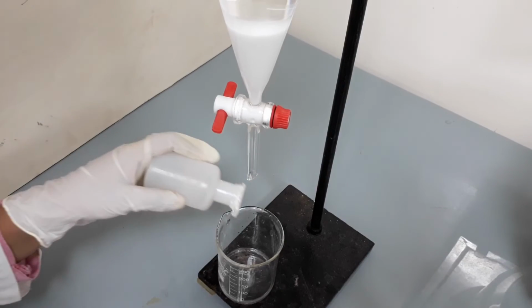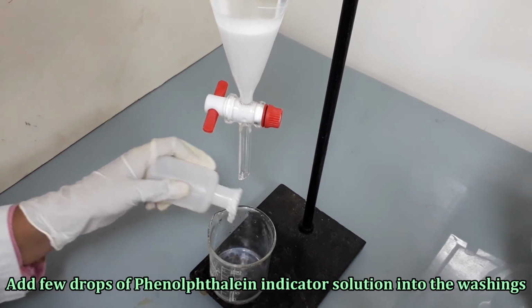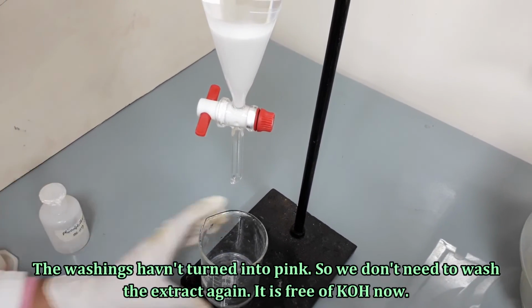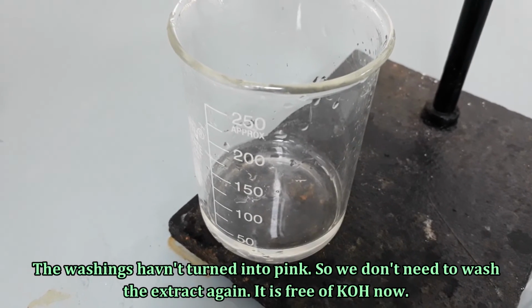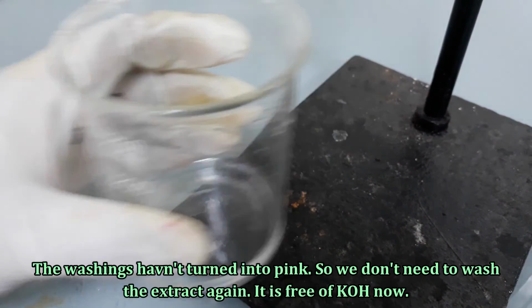Add a few drops of phenolphthalein indicator solution into the washings. This time no color change is observed in the washings. So we don't need to wash it again and it is ready to go to the next step.